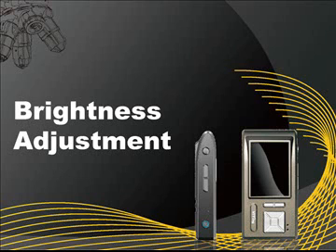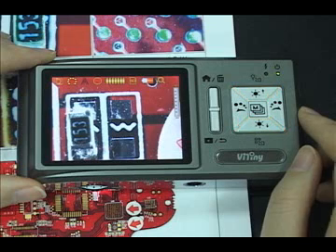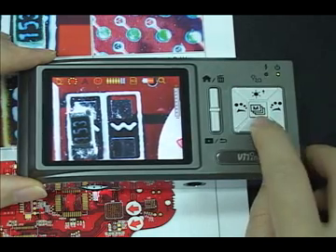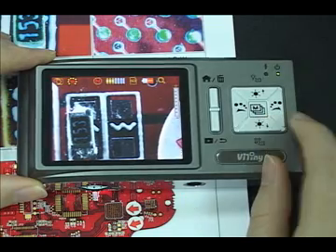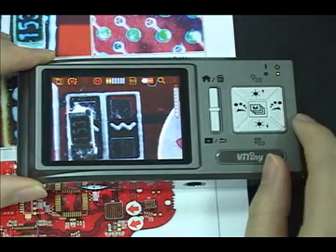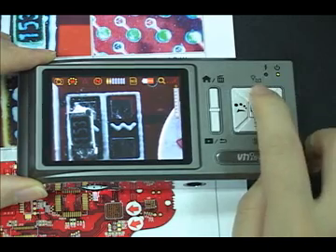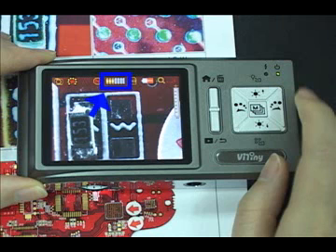Brightness adjustment: press the up and down buttons to adjust brightness. On the top of the screen you can see the brightness icon.